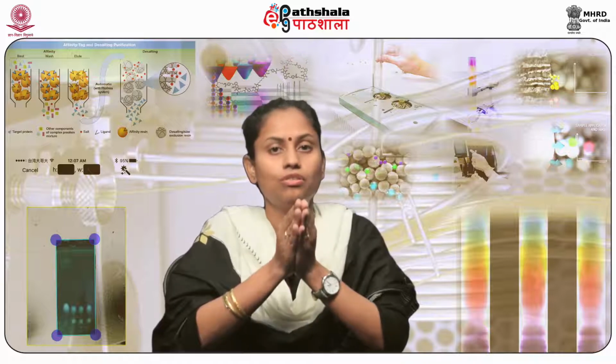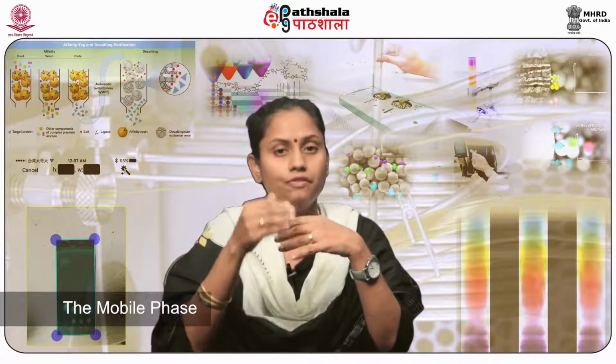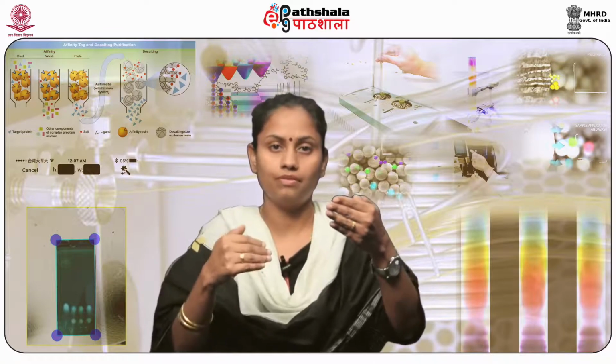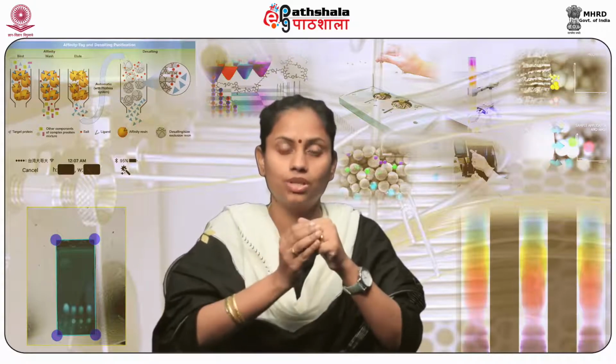The mixture of compounds that are to be separated is introduced into a chromatograph via the mobile phase. The different compounds present in the mixture have different affinity towards the stationary and the mobile phase. This basic principle helps in carrying out separation or purification of compounds from the mixture.